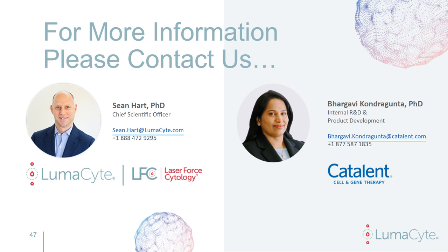I think the second part was how or why is it so much more sensitive? Radiance is measuring phenotypic changes in cells based upon those intrinsic biochemical and biophysical changes. One example that I shared earlier was when virions are produced inside a cell, it changes the refractive index, which we're very sensitively able to detect by integrating forces across the entire cell, which leads to the change in velocity, which is one of the principal measurements of optical force that we make.